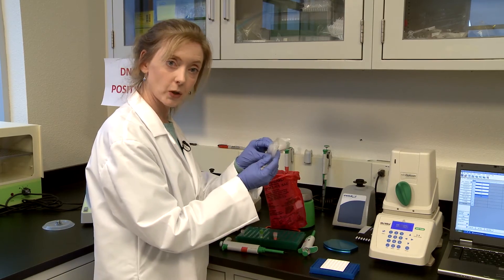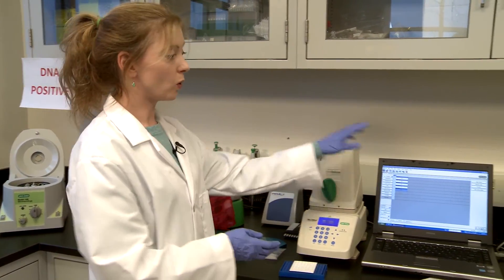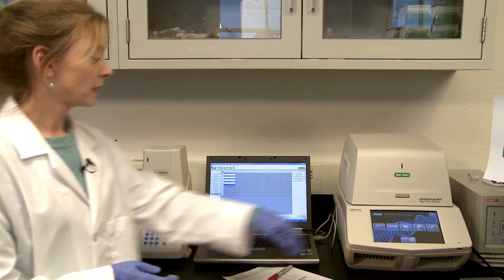Seal your plate with optical caps and put it into your thermal cycler — we have a small or a large one for 96-well plates. Then you hit start, and at that point you can take a break and come back. When you get back you'll have your wonderful results printed out and you can go through and look for positives and negatives.